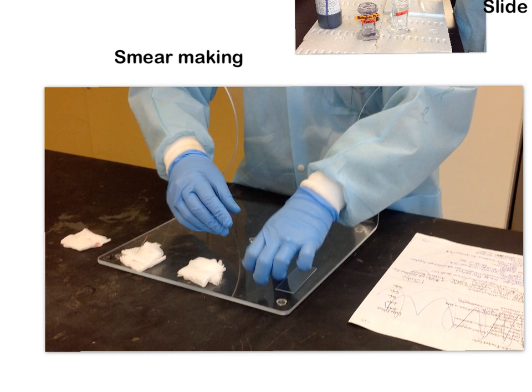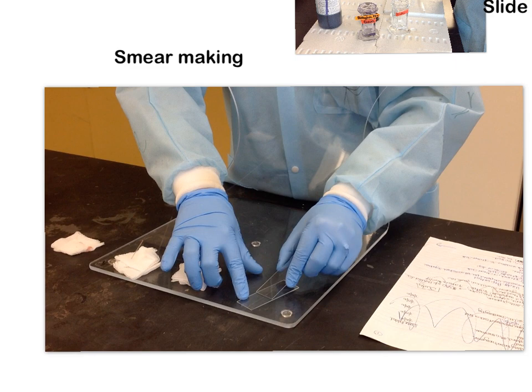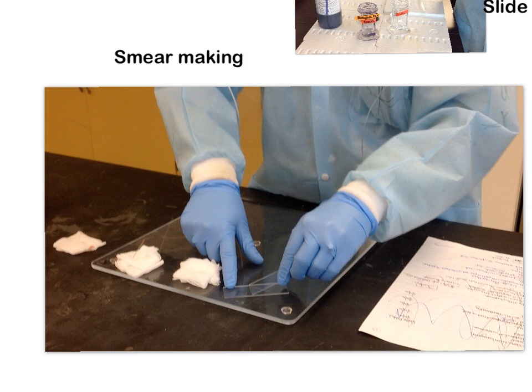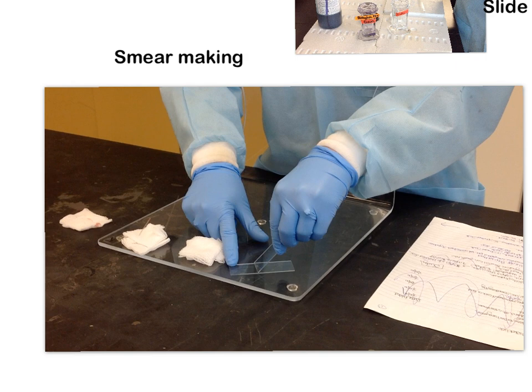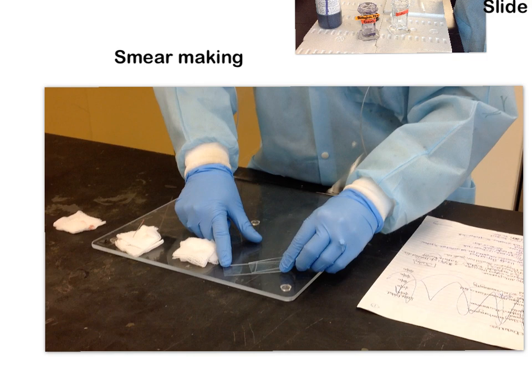When we talk about angle, we're talking about the angle of our spreader slide in relation to the specimen slide — the angle of the spreader hovering over the slide where you've put your specimen. The angle we want is about 30 to 45 degrees. If the angle is too high — more than 45 degrees — you'll end up with a really short, squat, fat smear. But if it's lower than 30 degrees, you'll end up with a really long, thin smear.